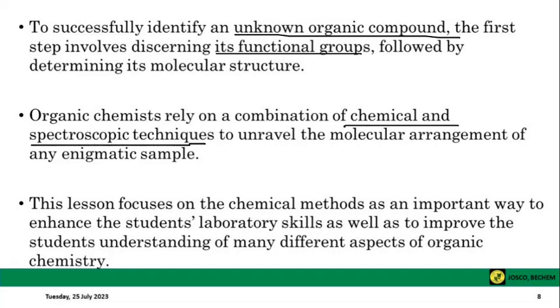By so doing, this lesson would focus on the chemical methods that can be used in the laboratory in order to identify various aspects of organic chemistry, or the various functional groups found in organic chemistry. Like I've initially said, this lesson would concentrate on unsaturated organic compounds.